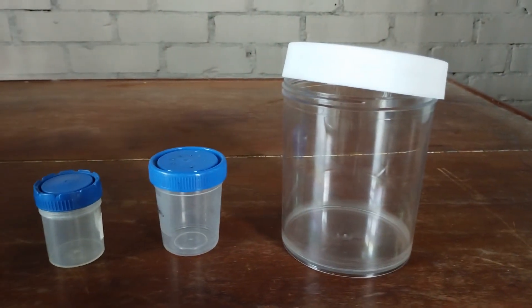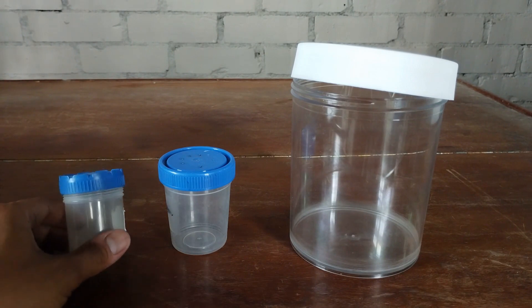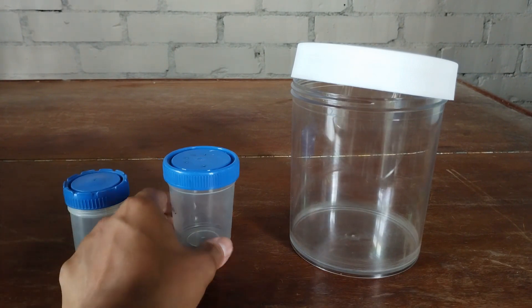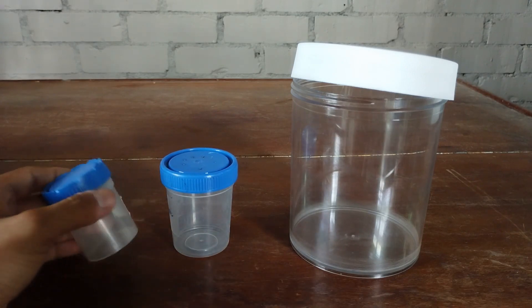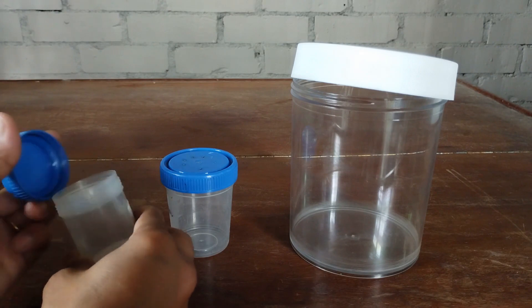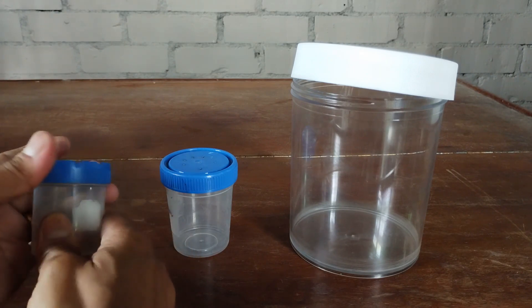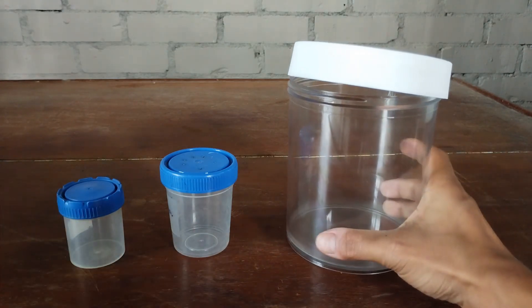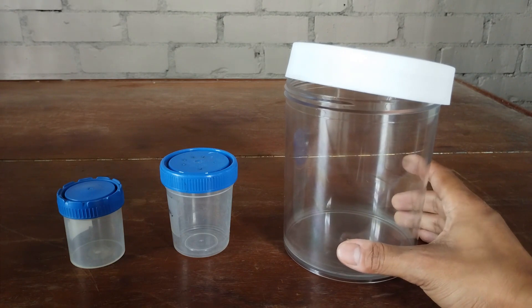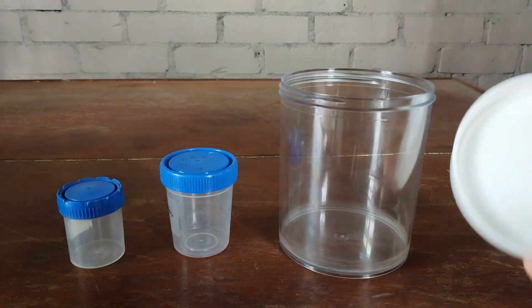Pathology containers are another ideal choice for storing wet specimens. These 50 ml and 100 ml specimen containers — more commonly known as urine cups found in hospitals and path labs — have fairly airtight and watertight screw caps and can be used to store wet specimens of smaller sizes for a considerable length of time. This larger 500 ml capacity container is originally designed for storing tissue and organ specimens for pathology. It has a tight-fitting screw cap and comes in different sizes, with larger and smaller volumes also available.